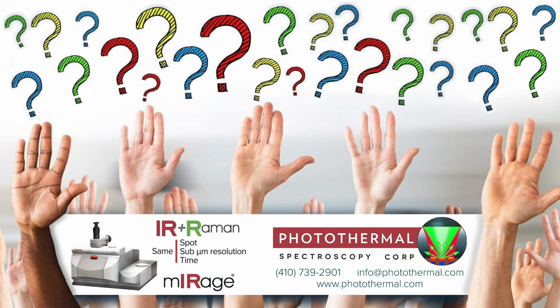This is also a recommended procedure when we discussed the calibration issue of Raman spectroscopy in the COST action Raman4Clinics. Polystyrene was one of the test samples which were sent around in a round robin trial, and polystyrene was one of the plastic spectra.